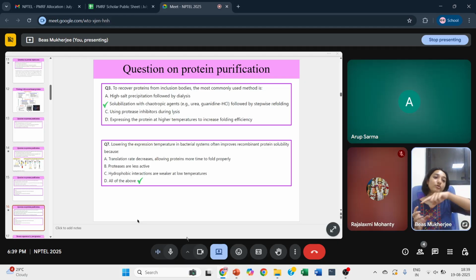And then when you are passing it through this affinity chromatography, it will refold into its functional native state, and this is called on-column refolding. So when you're passing it through the column, it will refold. Now we in our lab use this a lot. Why? Because the proteins that we work with are DNA binding proteins. So even after we are adding DNase, which is chopping off all the DNA that the protein is bound to, right? So these are transcription factors.